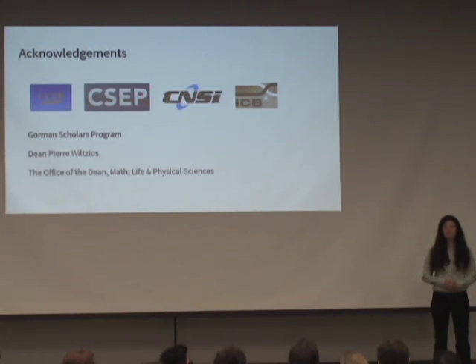Have you done experiments with particle sizes at the same time? Yes, the 5 and 15 are at the same time. I've also done them separately. If you come on Thursday, you can see my poster and it has more data represented. I was pretty excited about the graph that shows them crossing because I'm using fluorescence microscopy, and the 5 and 15 are tagged differently, so I can change the filter on the camera and actually see differences between them. I've also tried 15 and 10 together, and they overlapped because they had the same tag. But the 15 and 5 are in the same solution together. Do they behave the same way, whether they're by themselves or together? They behave very similarly, yeah.